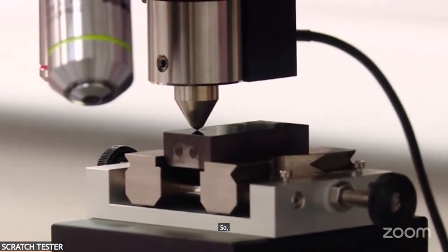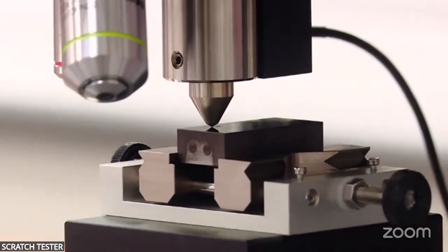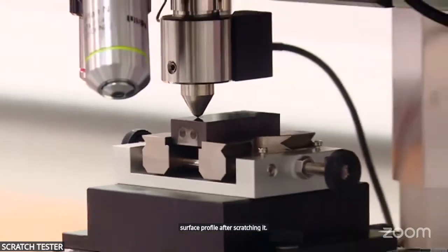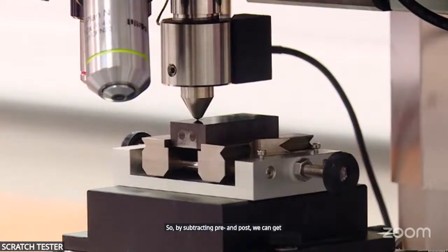So our scratch is done. Now it's doing the post scan to check the surface profile after scratching. So by subtracting pre and post, we can basically get my residual depth.